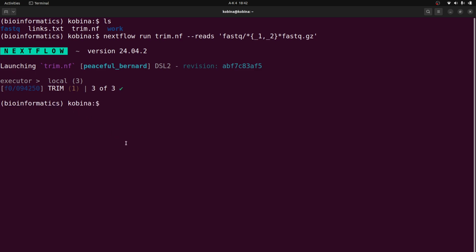All right, so now we have everything done. Once everything is done, you will see this coming up. Sometimes you also see the time displayed for you, to know that everything is fine. In some cases, the time taken for everything to run will be displayed, in some it will not, but it's fine. Once you see this, everything is perfect and great.